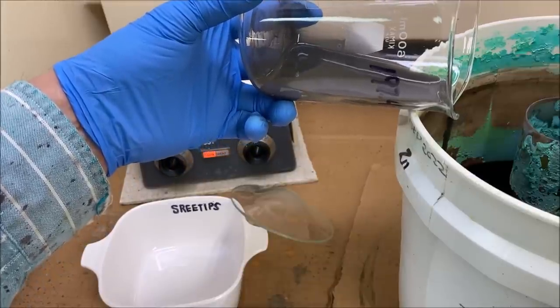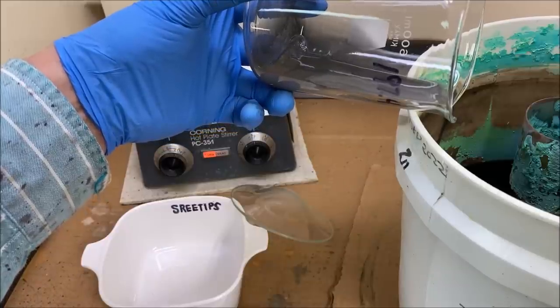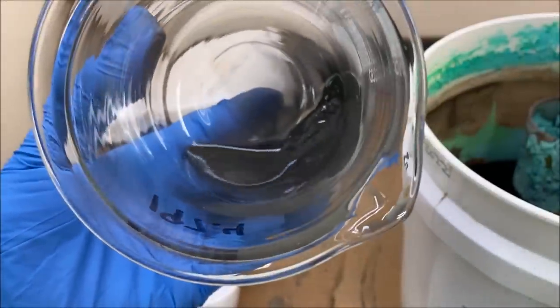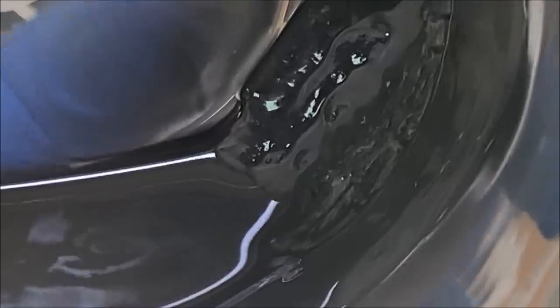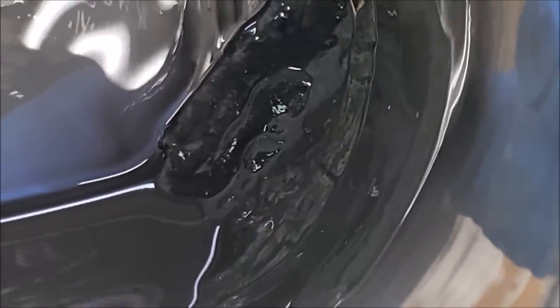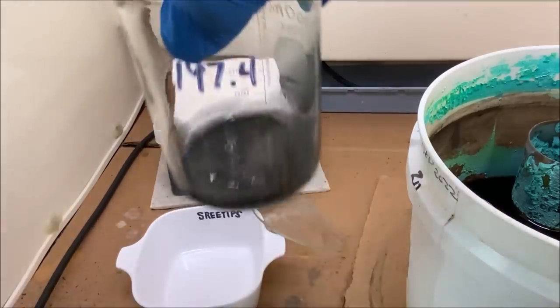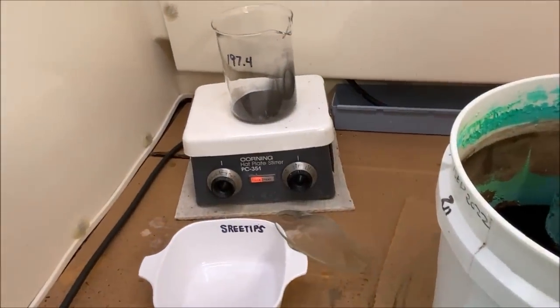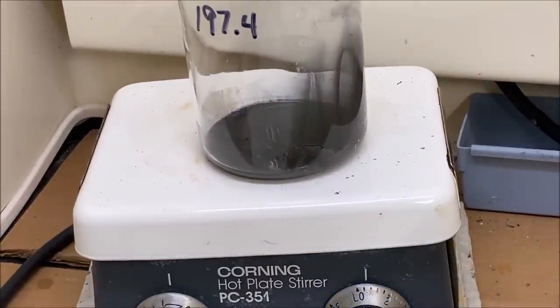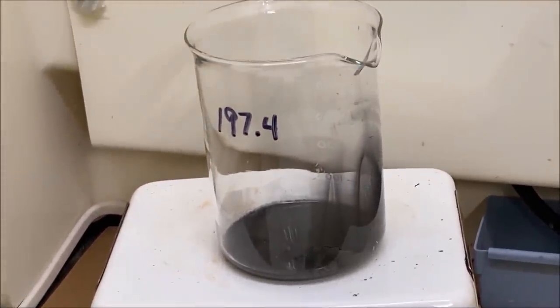It's going to pour this off. Some of our material is going to get poured off with this. And there is our black platinum powder down there. Should be fairly clean by now. All right, here we go. It's black powder. What I'm going to do is set it up here, and we're going to put on some low heat and dry it out so we can get a weight on it.